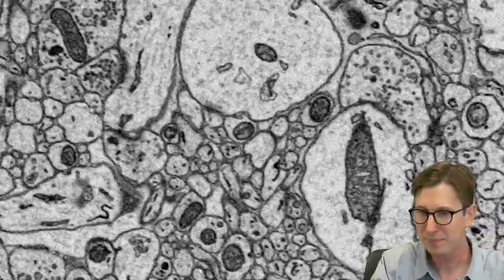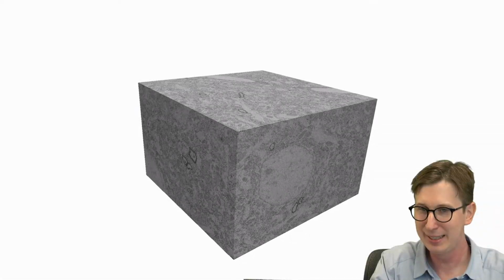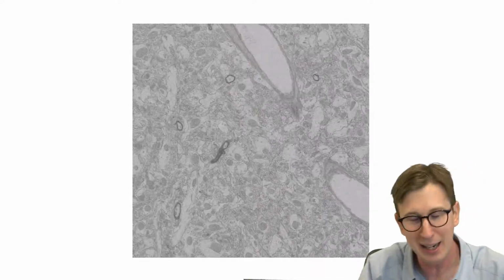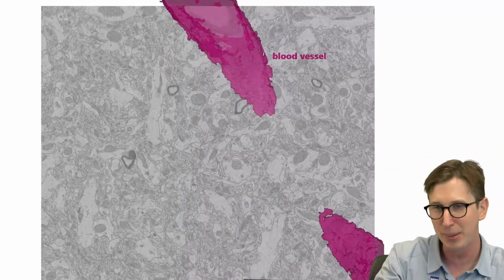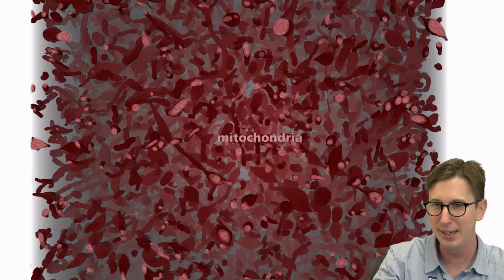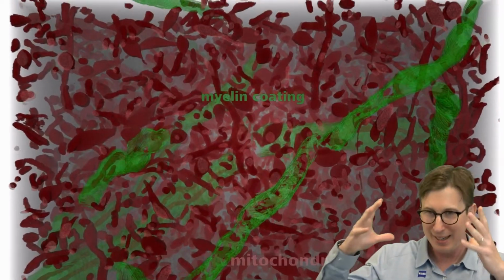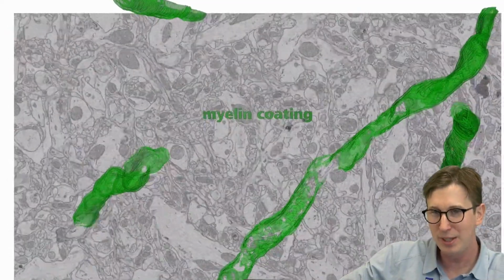Let's take another look at the data that we saw earlier. Here's just a deeper dive into this tissue and all the different kind of information that you can pull out from this volume. We can segment the blood vessels, right? And this is all done in ZEISS's arivis software, where you can take the data you get from the Volutome and you could really start asking a lot of questions.